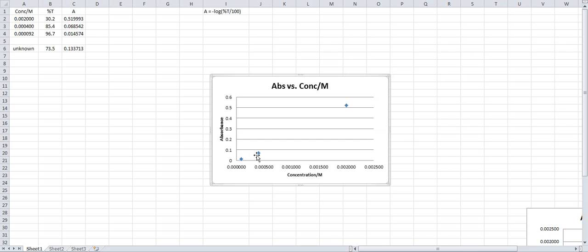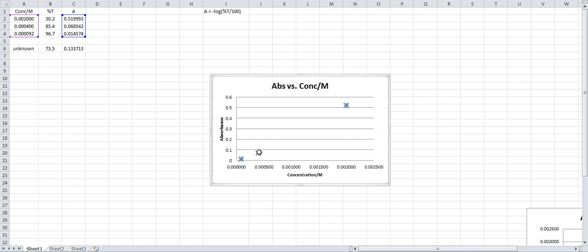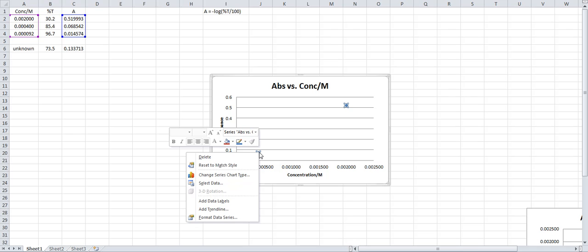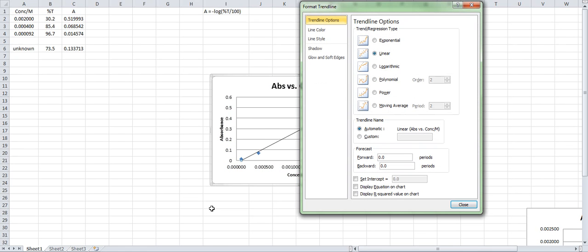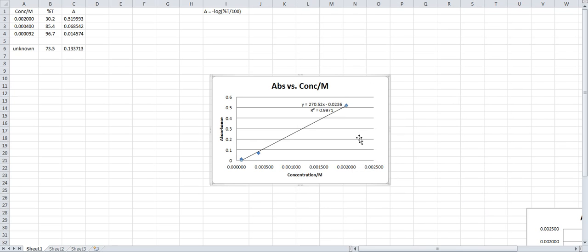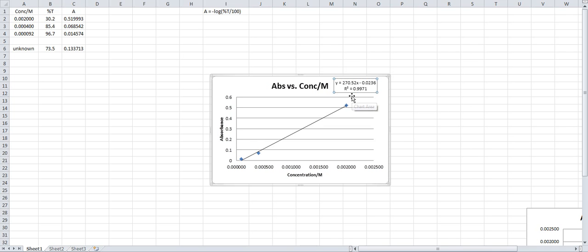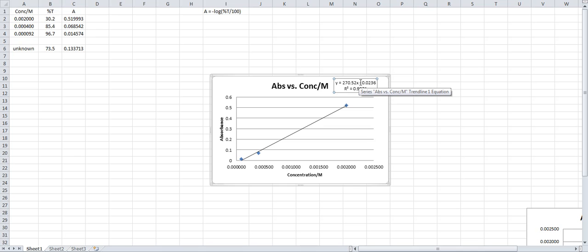You need your trendline. So what you do is you right click. Add trendline. You will now... It's linear. You go down. You display your equation. You now display R. You close. And here's the equation of the straight line. R-square gives you some indication how good your data fits to that line. So what you now have is the equation of the line.